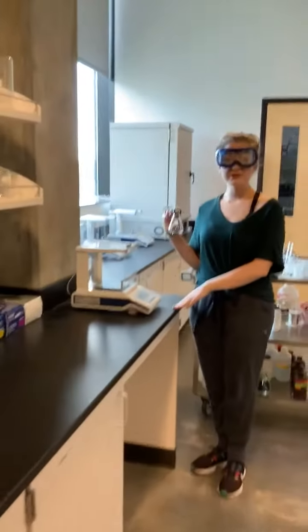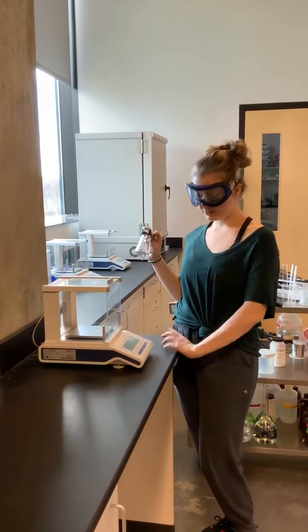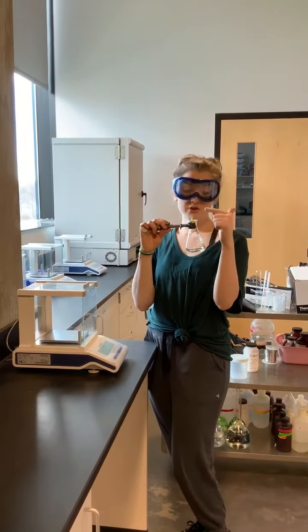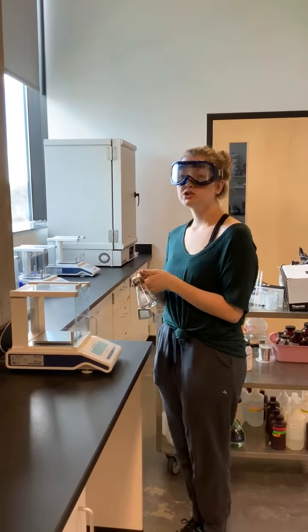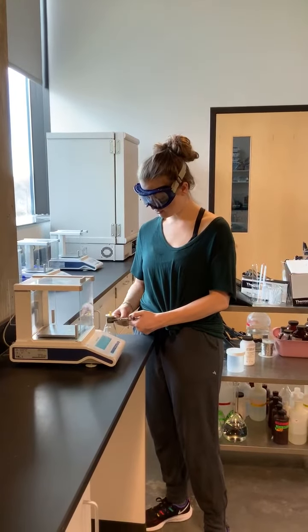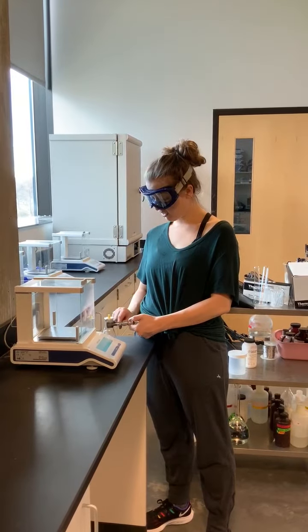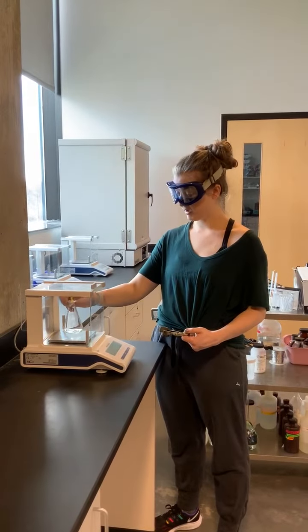What we are going to do is zero out the balance. We have our Erlenmeyer flask, we have our tin foil, and we have our thumbtack, just like the first time we massed it. And what we are going to do is mass it again, this time with the volatile liquid re-condensed at the bottom of the Erlenmeyer flask.